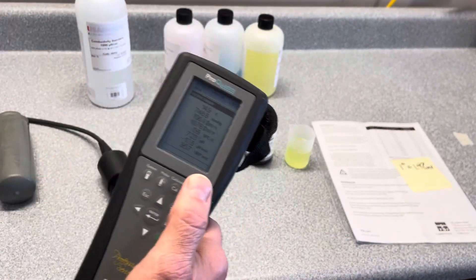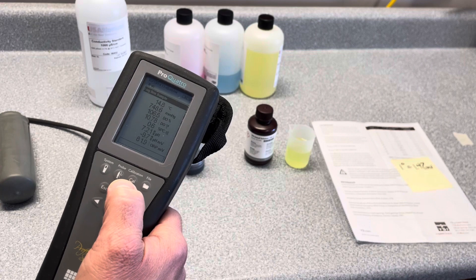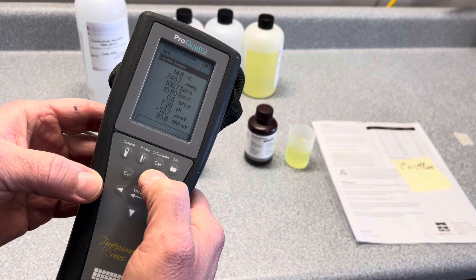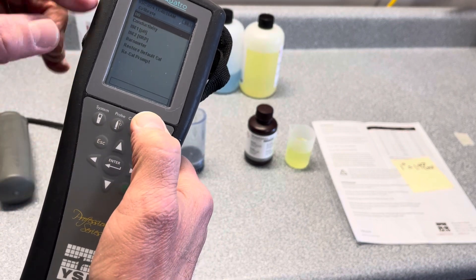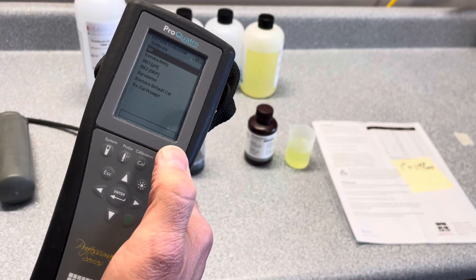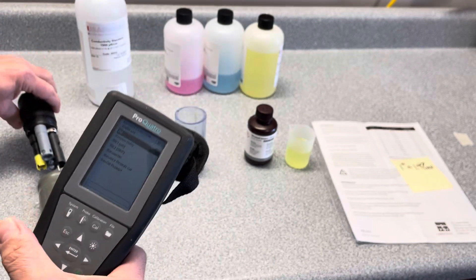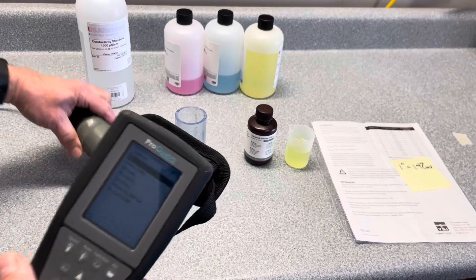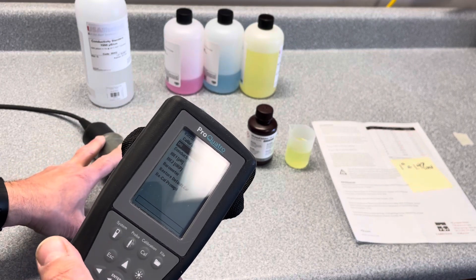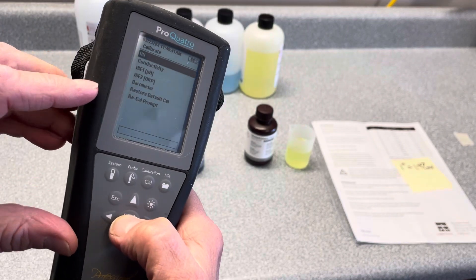I'm not going to do a full calibration, but I want to walk through the basic elements involved. The first thing we're going to do is press the Cal button and walk through each of the parameters. Right now we have DO highlighted. If you were calibrating DO, you would actually put your sensor into the calibration sleeve with that damp sponge and let it equilibrate for about five minutes or so.